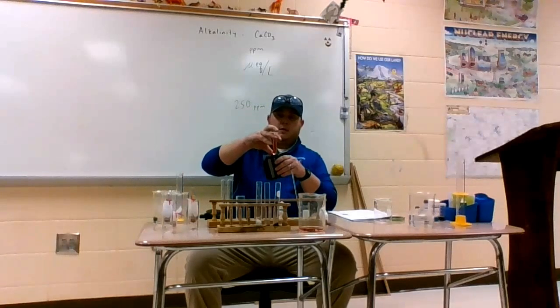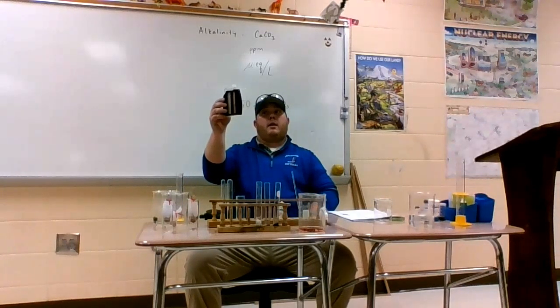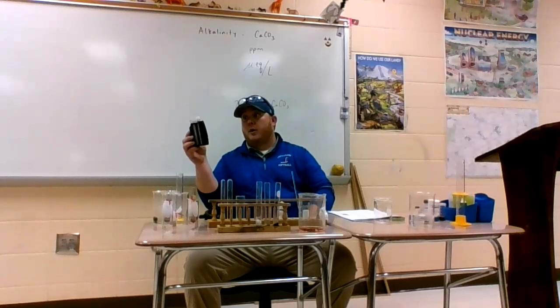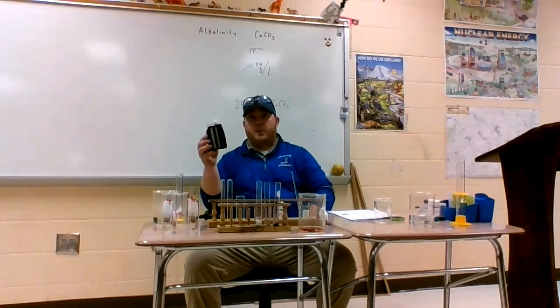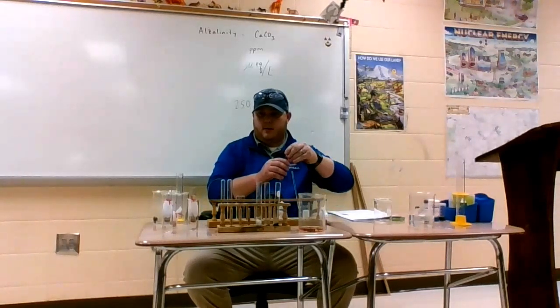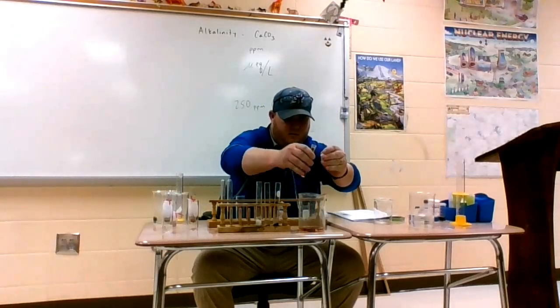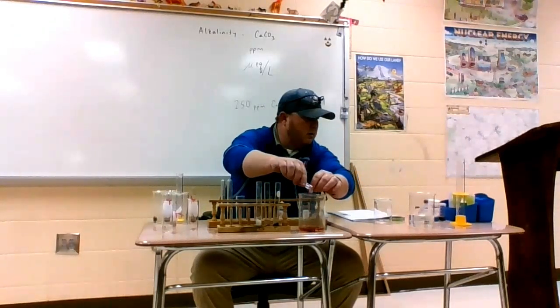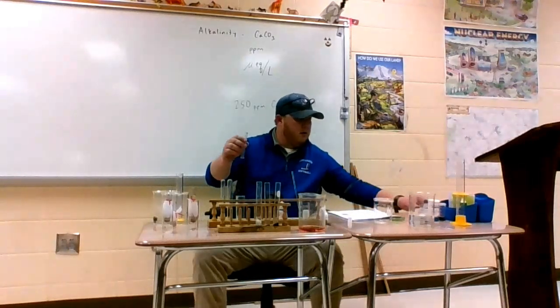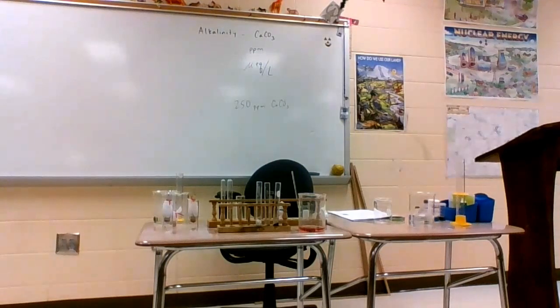Probably. You know, sand, that makes sense. Probably 3 or lower. 3 or lower is pretty red for sand. What about the humus? 3 or lower. When it's like 3 or lower, it's like a 2. Yeah, lower than 3. For sure.